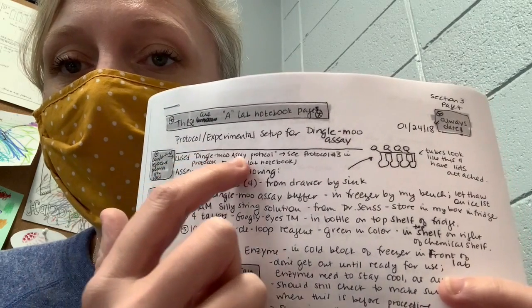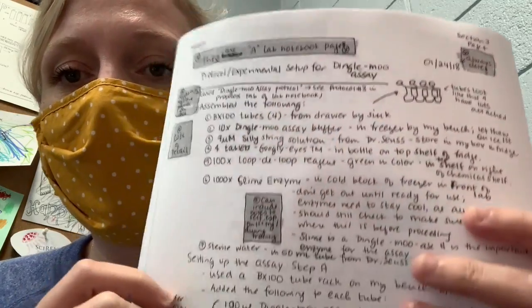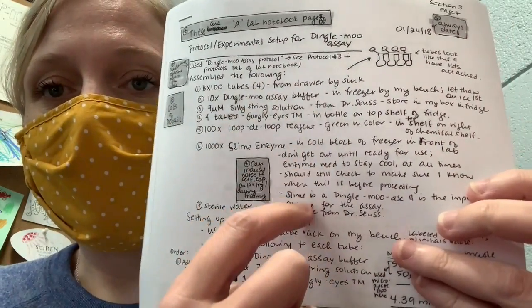It references what protocol is being used. It's dated all the time. You can see that this is really well explained. There's even notes to yourself, like you should check this, or I didn't get this out until I was ready to use it, or where things are.